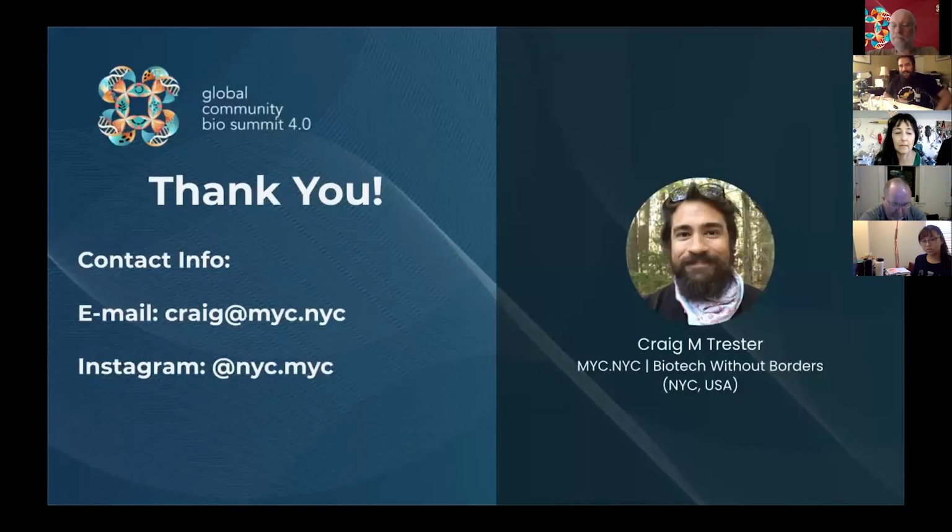So that was Seat of the Pants soil microscopy demo. I'm going to basically link to a bunch of other videos along with this presentation and resources back in the Google Drive. But let's save the last 5 minutes for Q&A. I hope you all enjoyed. It's great facilitating this at home. All you need is a compact light microscope that's got an iris diaphragm, and just a couple little tools that are really affordable and accessible. So feel free to ask any questions.